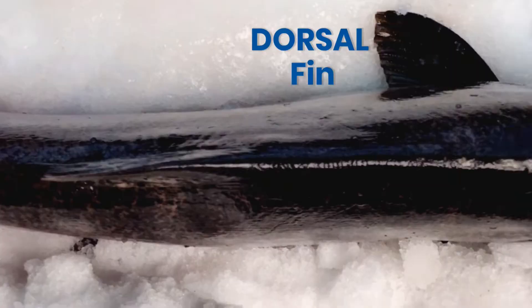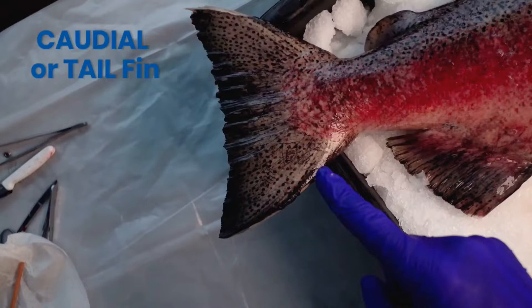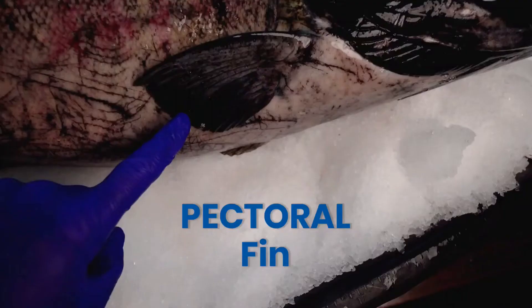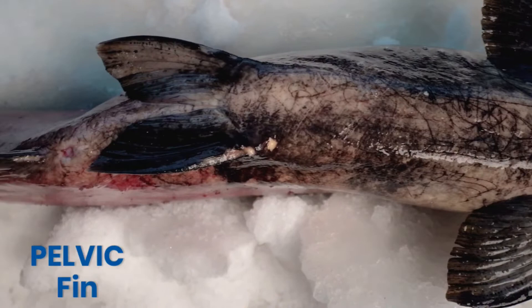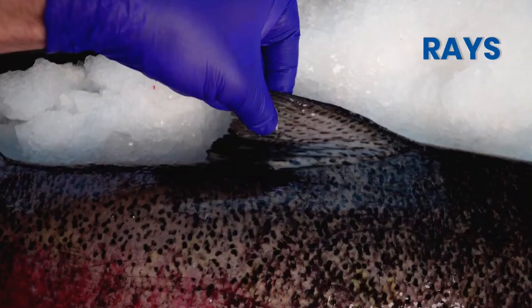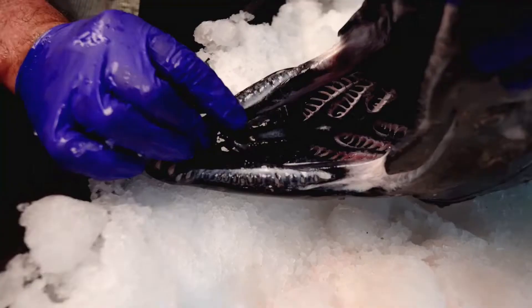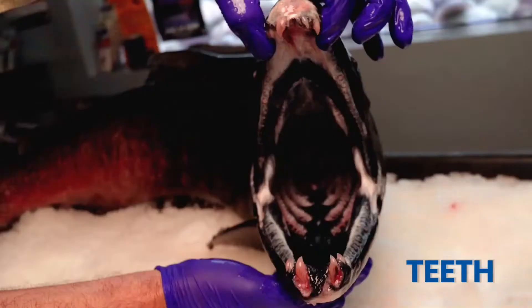Now onto our external bony fish anatomy — let's label the fins. Did you notice the rays of dermal bone? The scales of this spawning Chinook Salmon are beautiful. The jaw structure of a spawning male salmon is impressive. Any doubt that salmon are predators? Take a close look at these teeth.